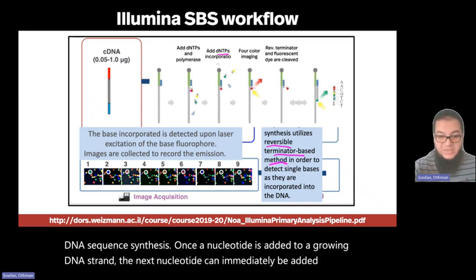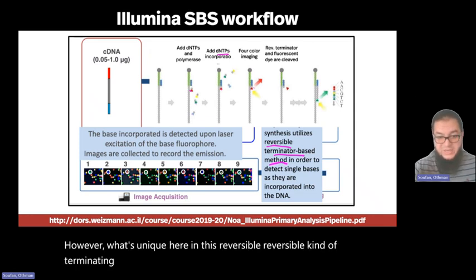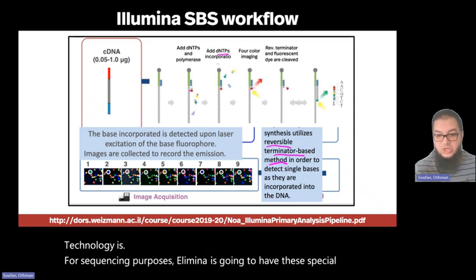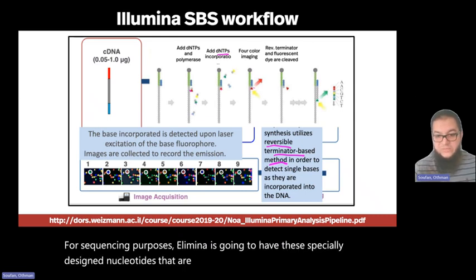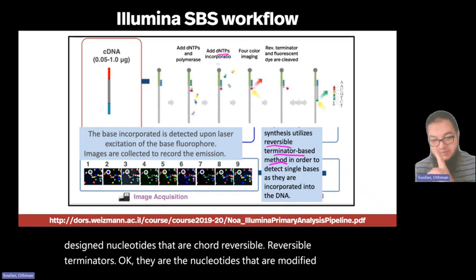However, what's unique here in this reversible terminator technology is that, for sequencing purposes, Illumina is going to have these specially designed nucleotides that are called reversible terminators.